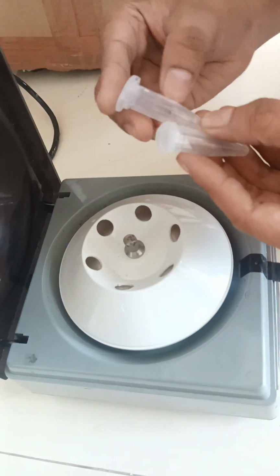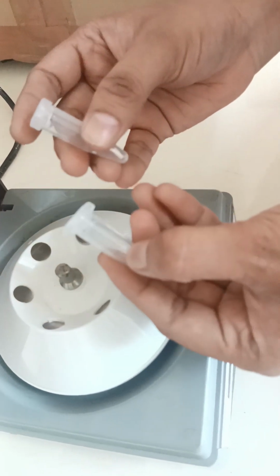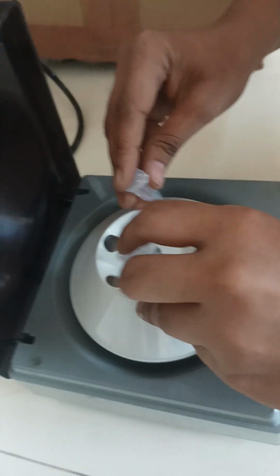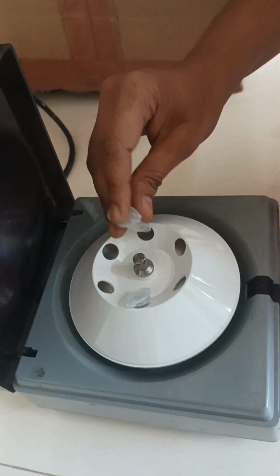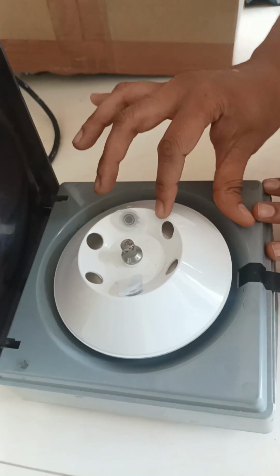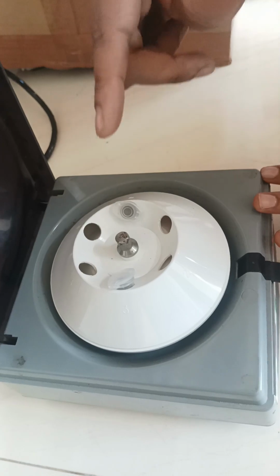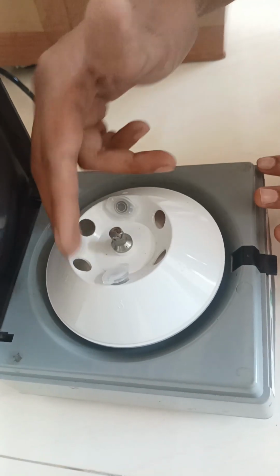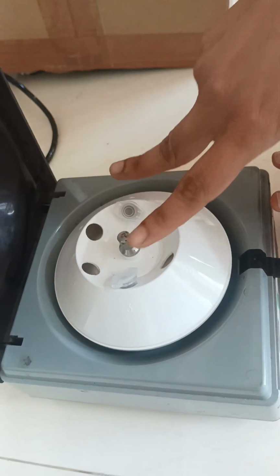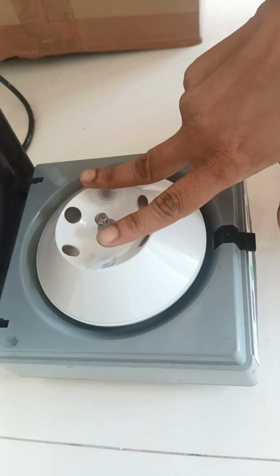Suppose you have taken 0.5 ml of sample, then you will put 0.5 ml of water into another tube and place it opposite each other in order to balance it. In this manner you will put them, so that the balancing will occur. Never run the centrifuge with one tube or an odd number of tubes. You have to balance it with 2, 4, 6 tubes, and make sure that the volume taken into the tubes is the same.